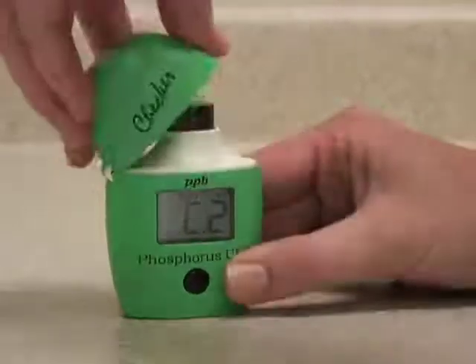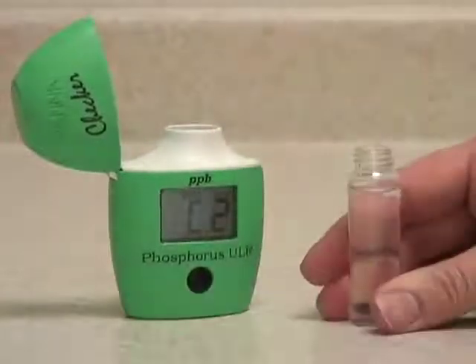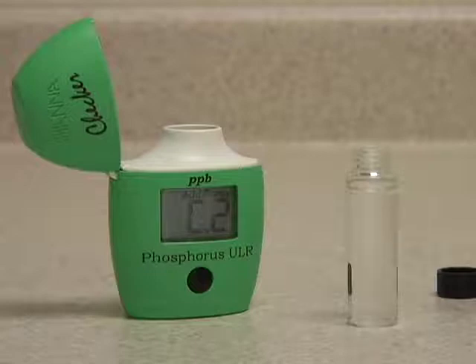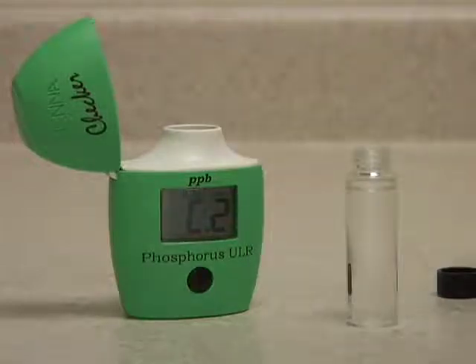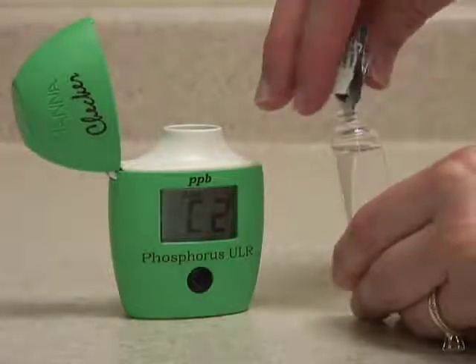When it says C2, take the vial out, remove the cap, pour in your reagent, and try to get as much of the reagent in as possible.